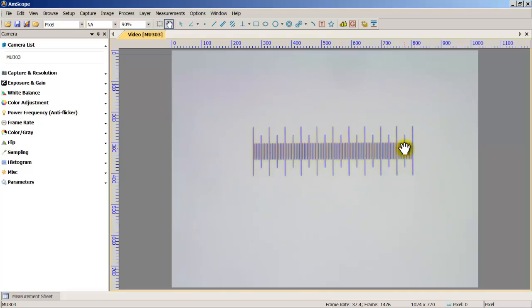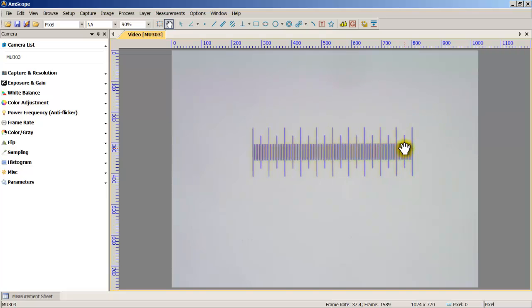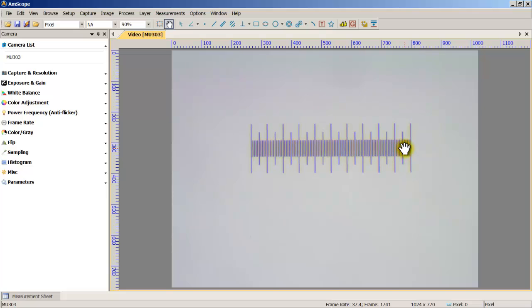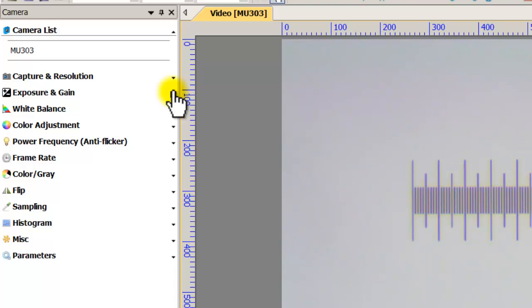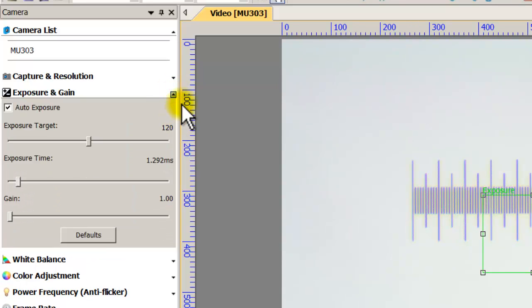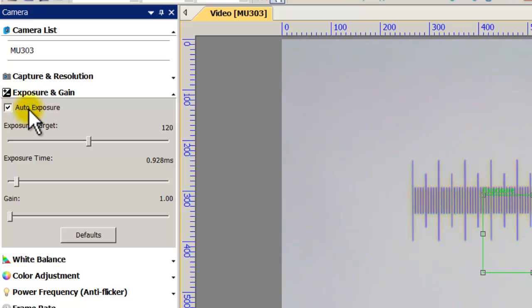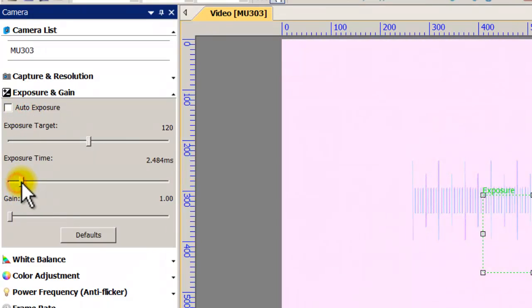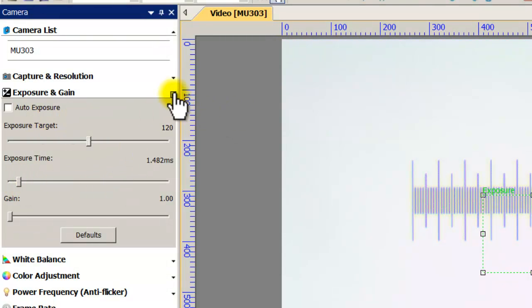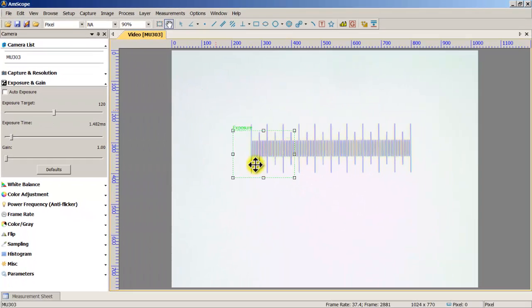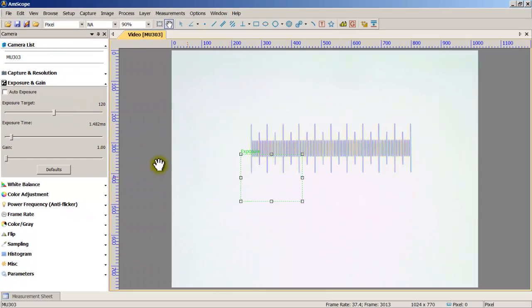I'm moving it around with the XY stage. If the image isn't bright enough, you can adjust the light on your microscope. If that's still not good enough, on the left-hand side under Exposure and Gain, click the dropdown list, uncheck Auto Exposure, and manually expose it to make it brighter. I'll go ahead and leave it at that and minimize the exposure box by clicking it so it disappears.